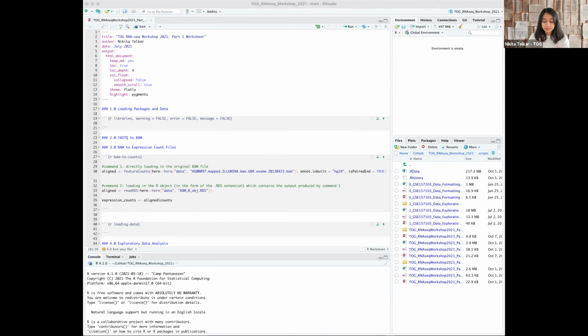There's 4 lines, it tells you the sequence, the quality, the score encoding, and all of that. And that FASTQ file, because it's an unaligned file, you need to then align it to the reference, like the human genome, right? Now there's versions of the human genome, and for those, you specifically require a couple of steps that you need to perform.